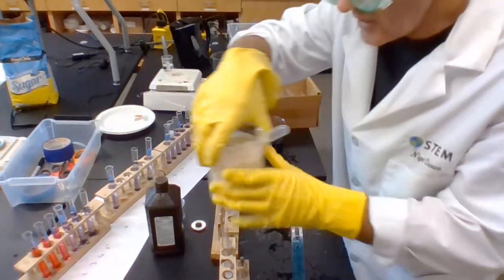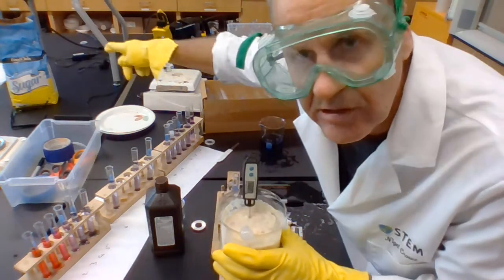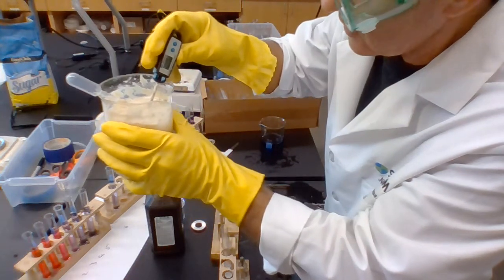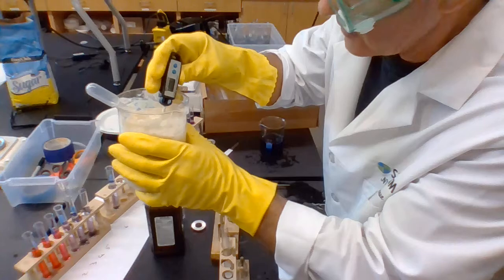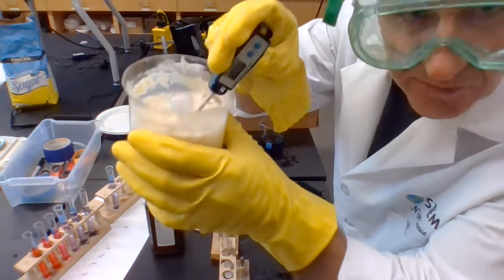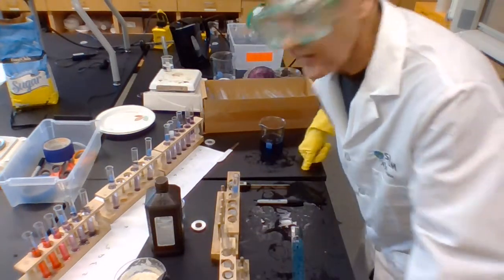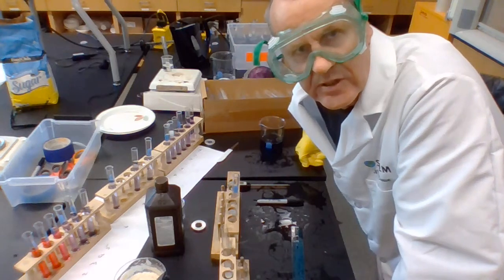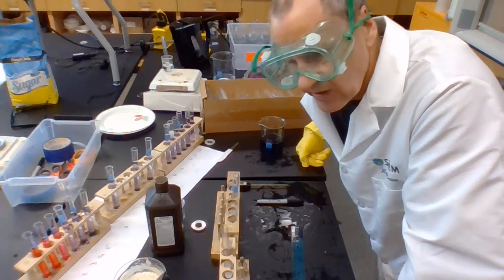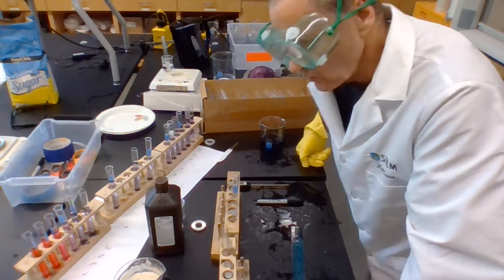The reason I've chosen yeast is I can keep the cells nicely alive by adding some sugar, and you can see the sugar over there. These have been soaking quite nicely in the sugar for quite a long time. They started off about 35 degrees Celsius and they're now like 27.4 degrees Celsius. So they should be quite happy now. They've had a bit of a feed of glucose, so they should have come to life in the hour and a half that I've left them there. So they should be nicely ready to work.